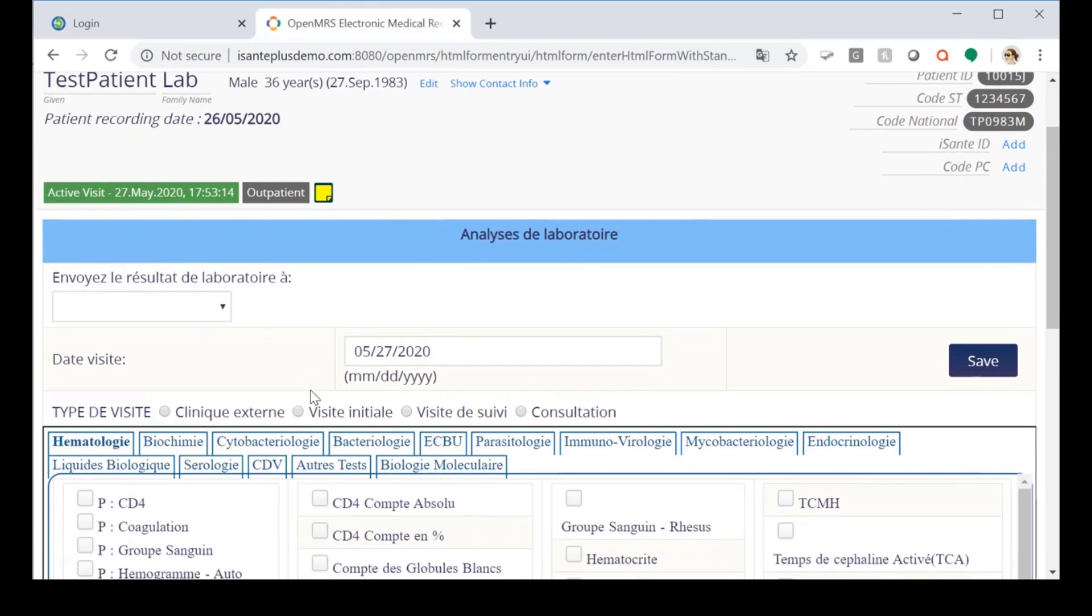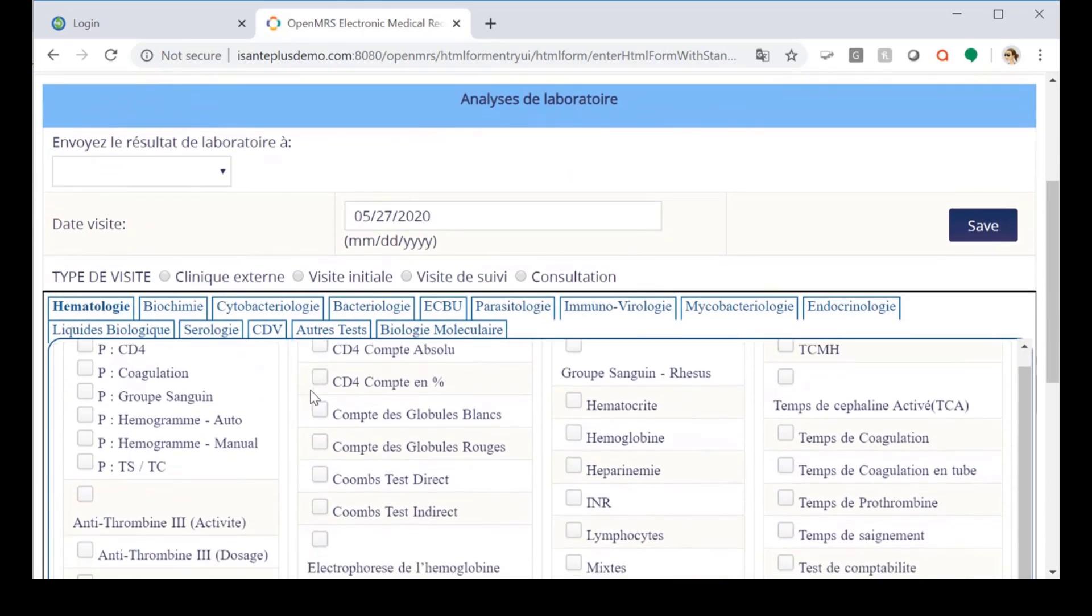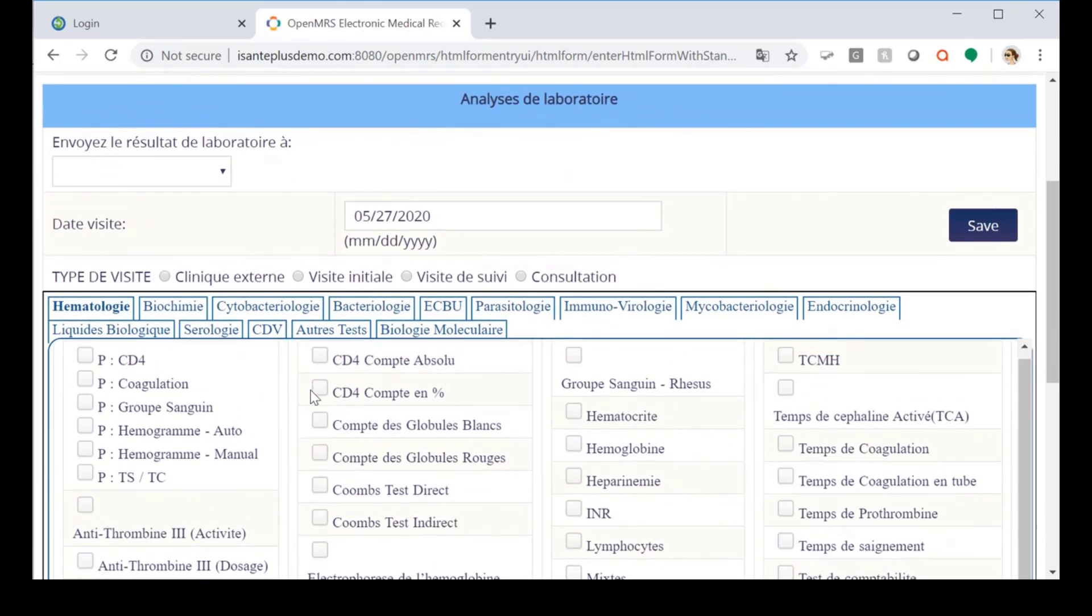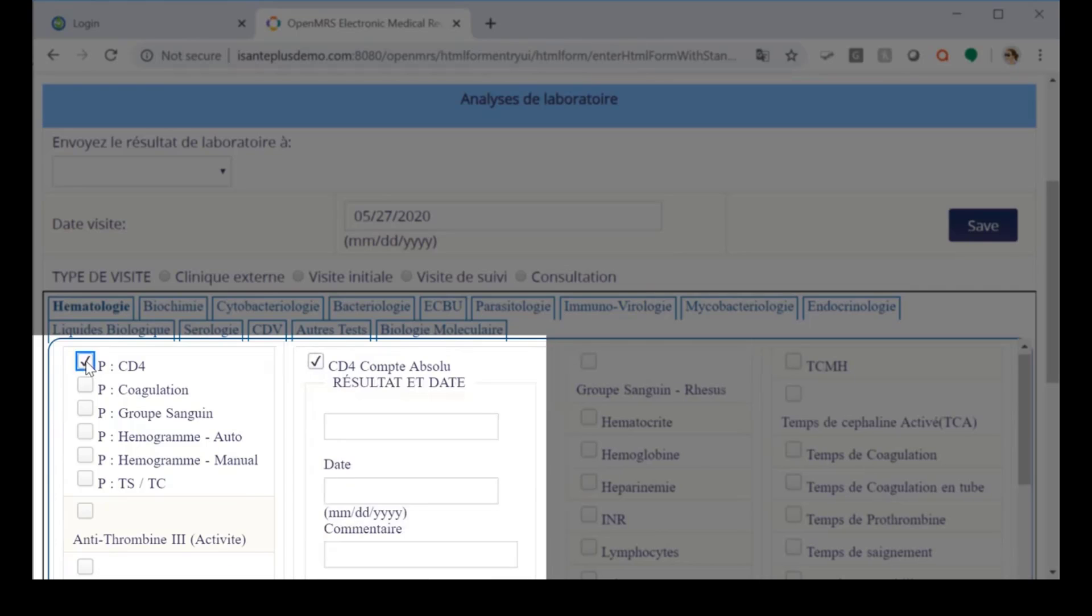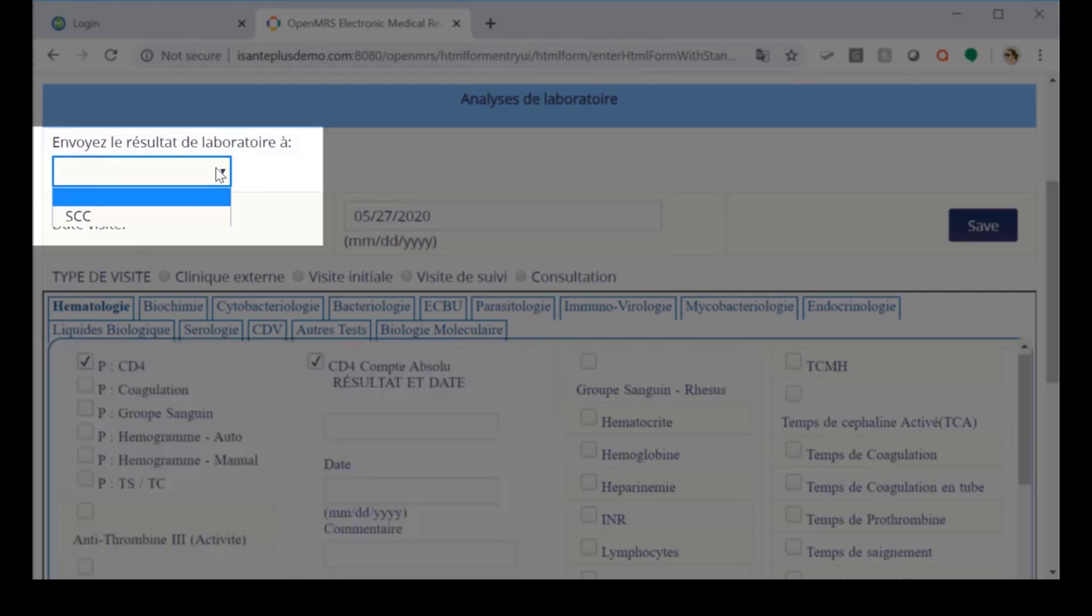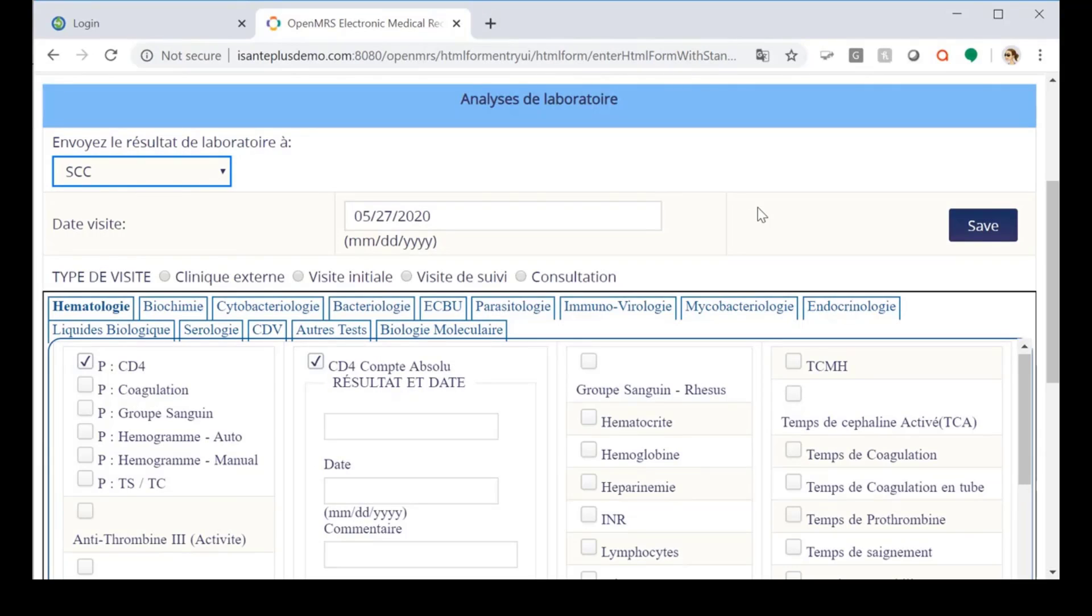Within the form, we're going to select the test which we'd like to order, which in this case is a CD4 panel including two tests. We'll select the facility which should receive the order and then we'll click save.